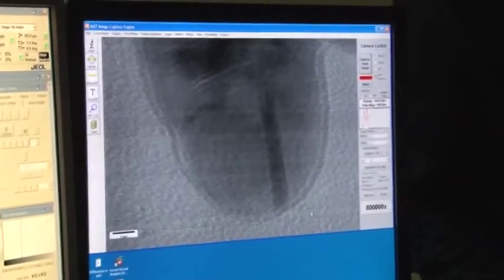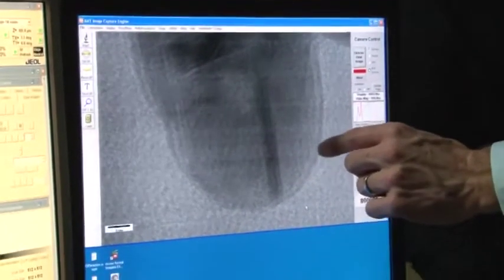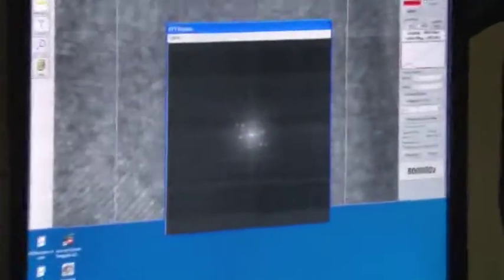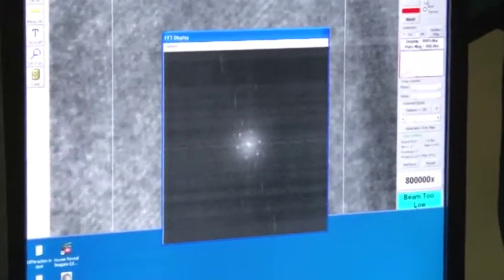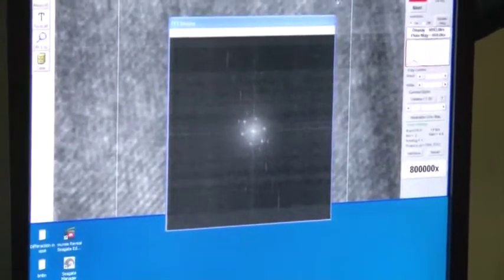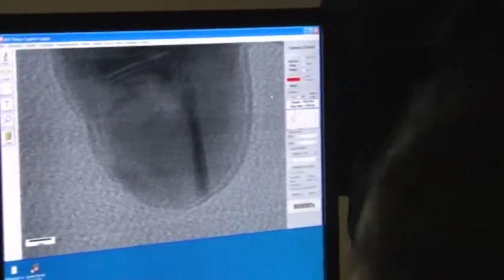And there's astigmatism, which you see now here. The fringes are far thinner than here. At that point it automatically zooms in for the FFT. You can try with stigmator correction. Not randomly, but you can optimize the basis of your fringes.